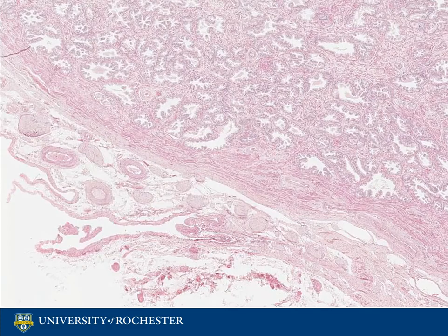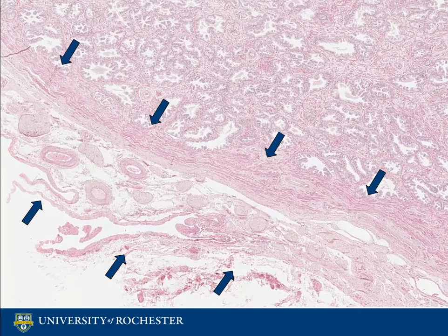You can see here that the outermost area of the prostate, or the capsule, is a thin layer composed of connective tissue, and it contains some smooth muscle fibers, blood vessels, and nerves.